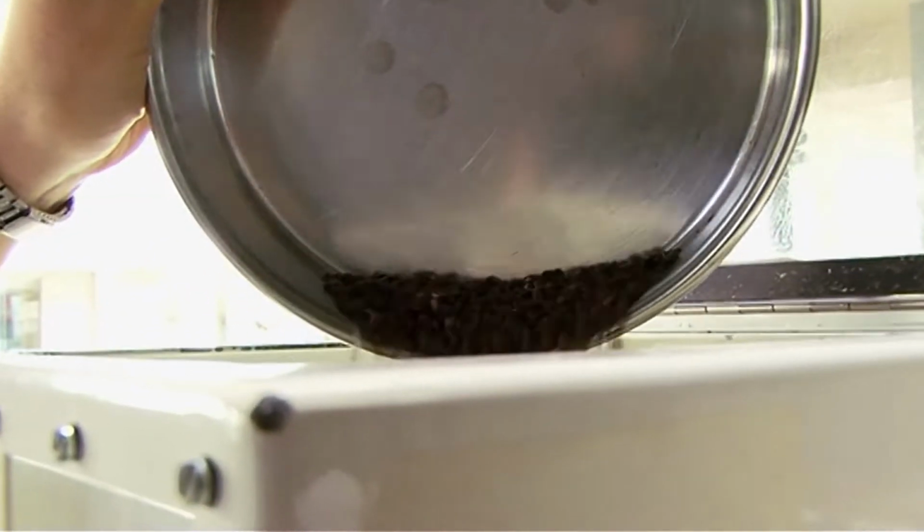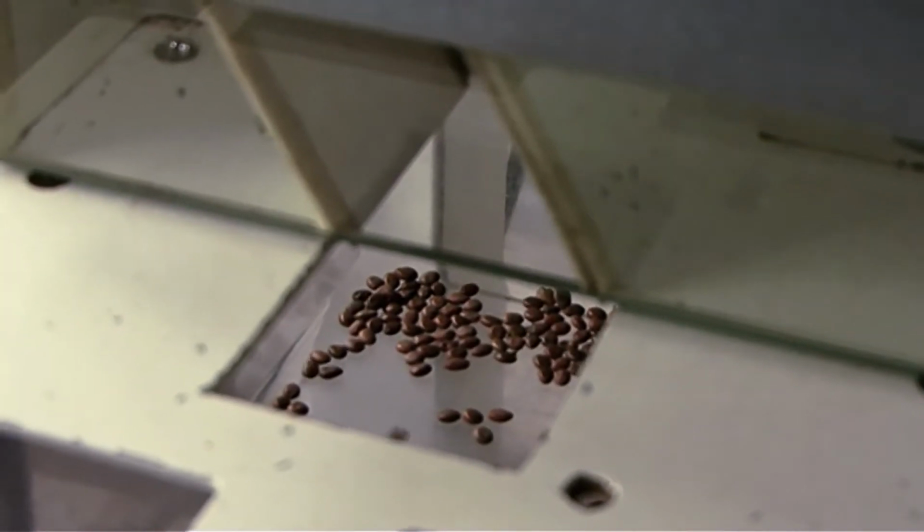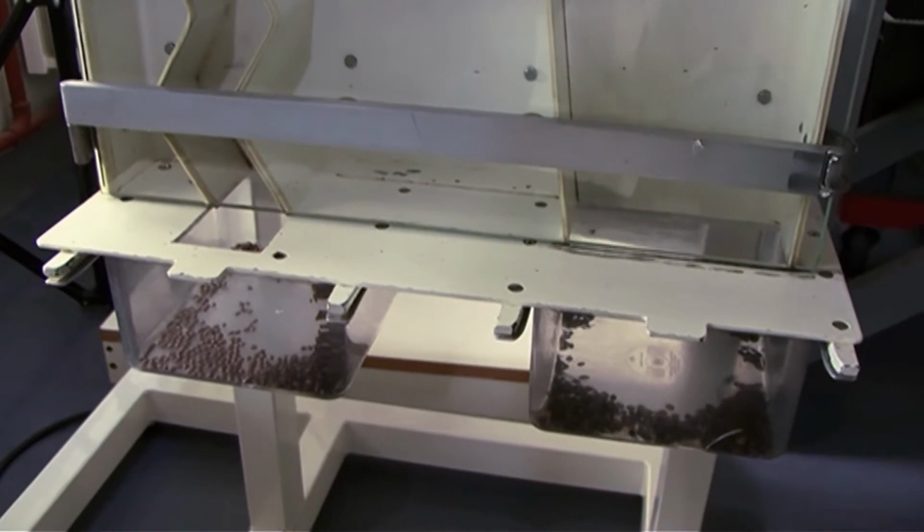So our staff use a simple system of rubber bungs and sieves to separate the seeds out from these structures. We use a column of air to blow through the sample, which hopefully enables the heavy filled healthy seeds to be held back, while the lighter empty and poorly developed seeds are blown off and can be discarded.